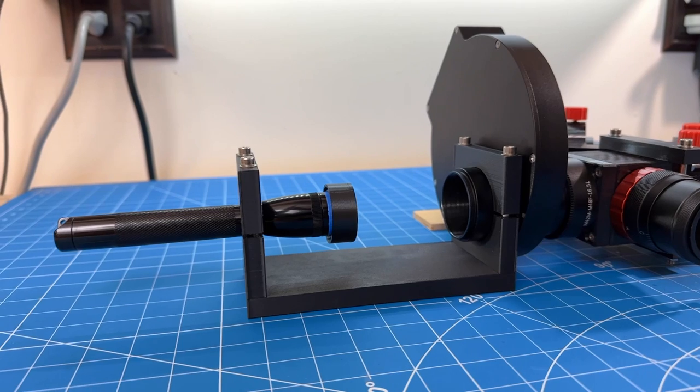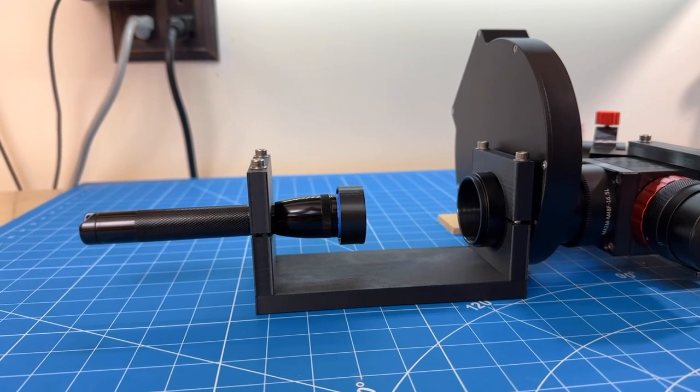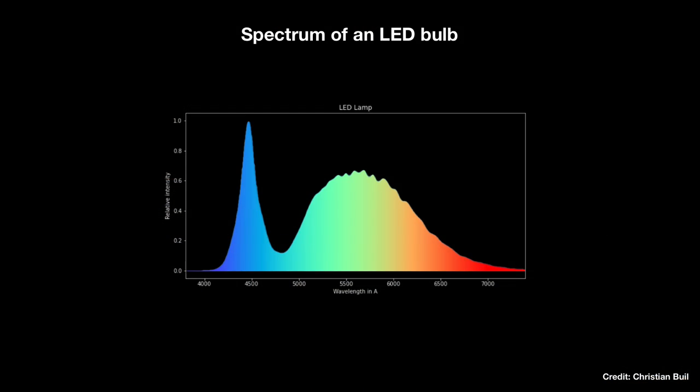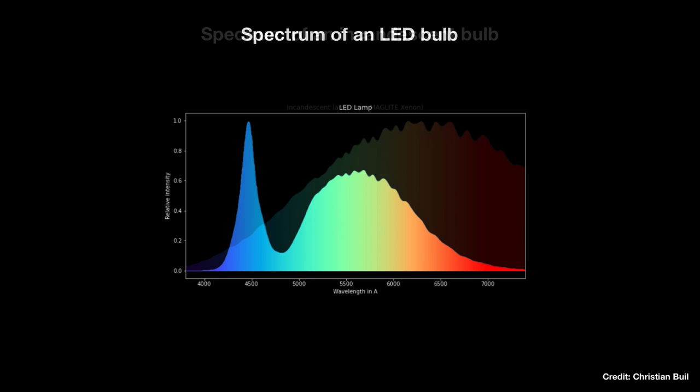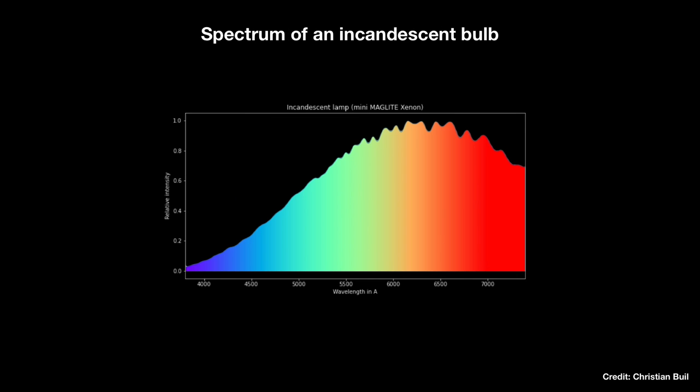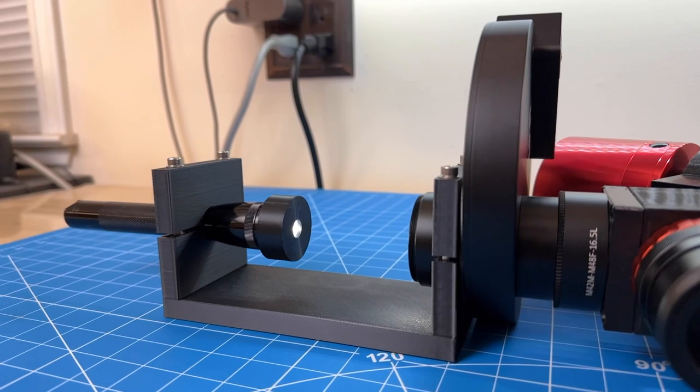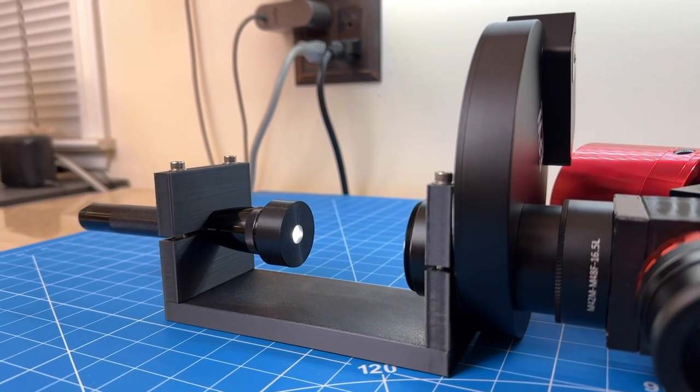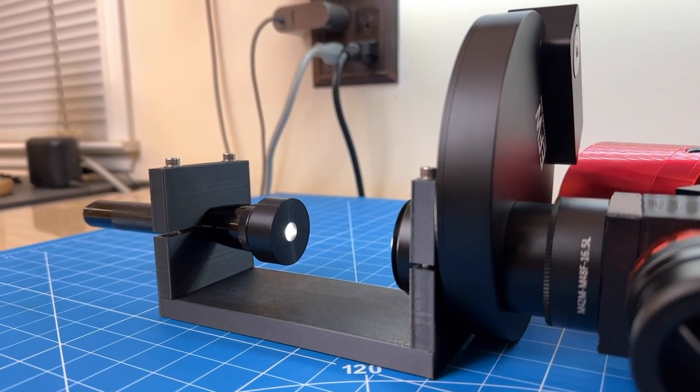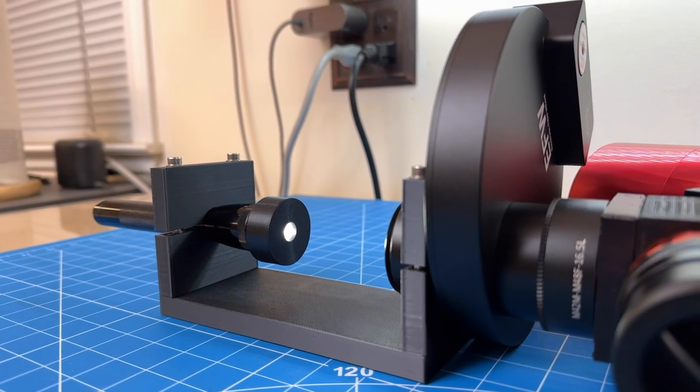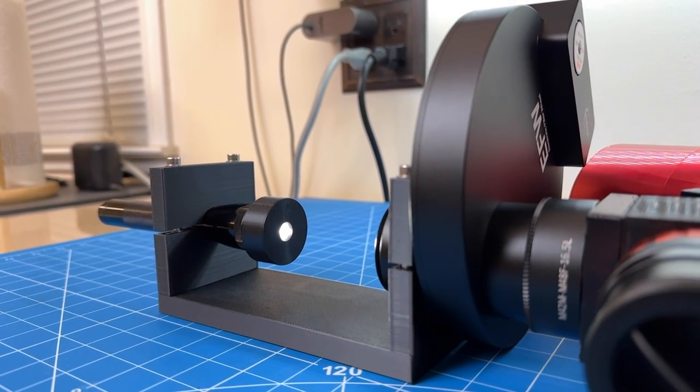You cannot use an LED for this, especially in low resolution, because the spectrum of an LED bulb goes all over the place, whereas a good old tungsten bulb has a spectrum that is much closer to that of a black body, so it's a lot smoother. I 3D printed a jig that allows me to keep the light source perfectly orthogonal to the filter that we are going to measure.